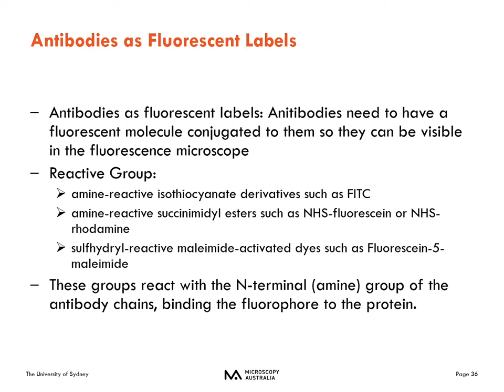Antibodies are widely used in immunoassays to detect and quantify antigens. When antibodies are used as fluorescent labels, they need to have a fluorescent molecule attached to them so they can be visible in the fluorescent microscopes. The reactive group can react with the N-terminal group of the antibody chain, binding the fluorophores to the protein.